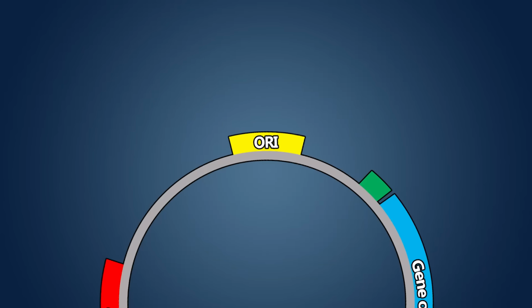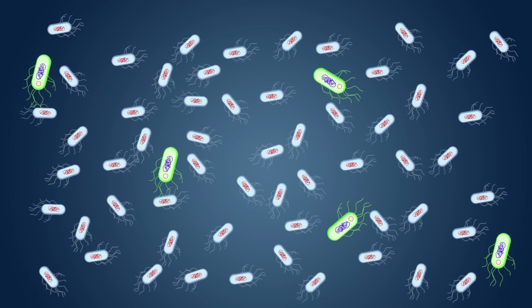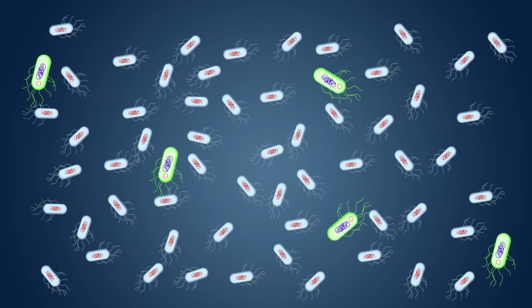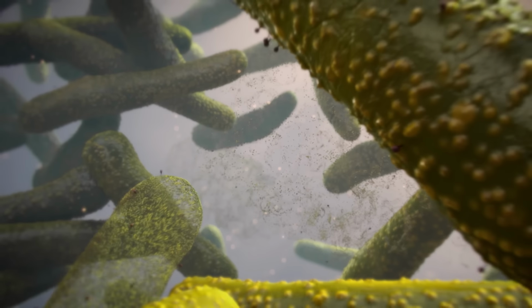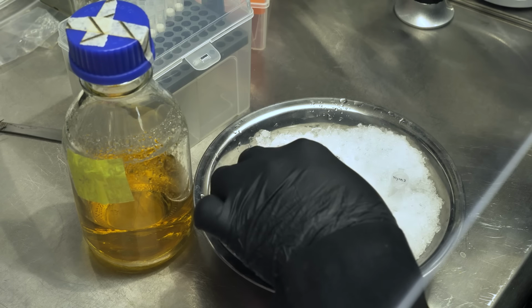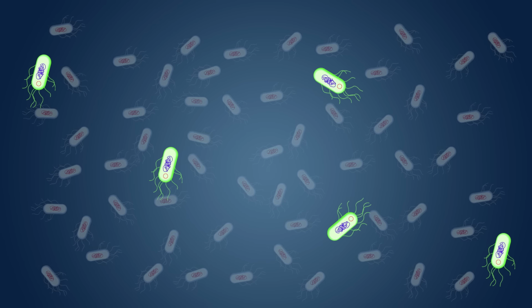With the ORI chosen, the other thing to pick is your selection marker. A selection marker is just something you can use to sort the modified cells from the unmodified ones. And since we can't go in with tiny tweezers and just pick out the good ones, this usually means something like an antibiotic resistance gene. This way you can kill off any cells that haven't taken in the new DNA by spreading the bacteria onto an antibiotic plate. When we go to actually put the DNA into the cells in a moment, only a tiny portion of the cells will actually successfully take it in. So we need to get rid of all the failures and allow only the modified ones to grow.